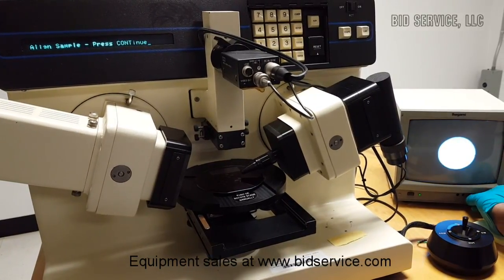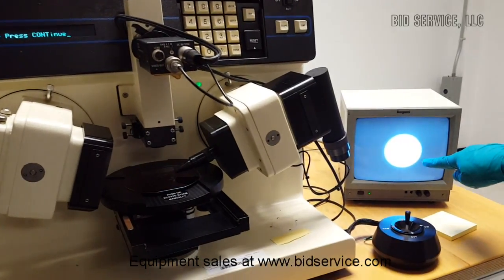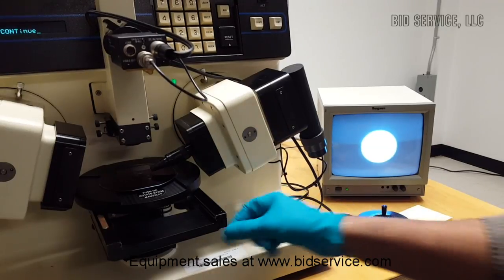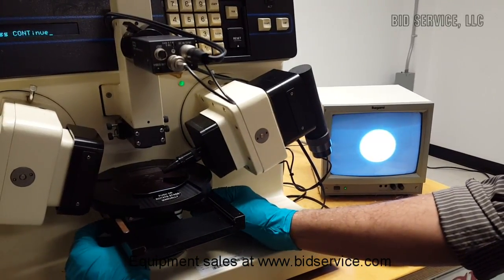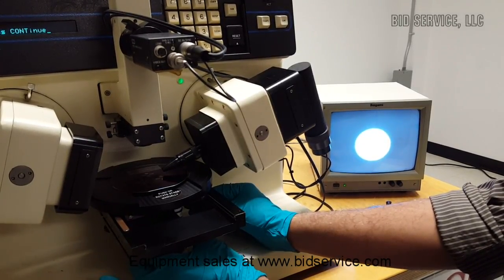it is important to make sure that the dot here, which is the auto collimator viewport, there's a CCD camera here, the dot should be centered at the center of this crosshair circle.